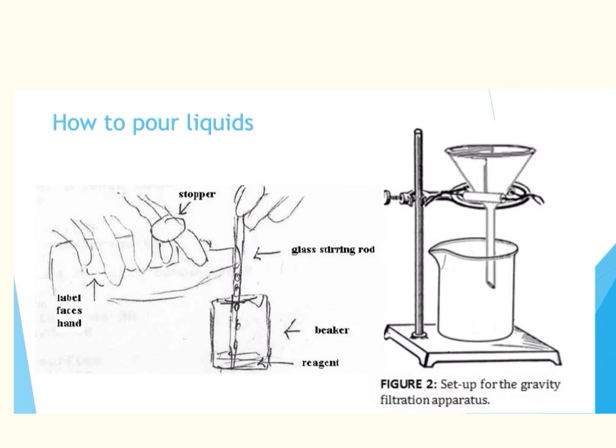Let's look at a few procedures. We're going to start with how to pour a liquid. Here we have a reagent bottle, a stirring rod, and a beaker. You'll notice that we are pouring the liquid down the stirring rod — we pour it slowly down the stirring rod to keep splattering from occurring. This is one procedure for taking a chemical from a reagent bottle and moving it to a beaker. Another procedure is to use designated pipettes to pipette out the exact amount from our reagent bottle and move it slowly and directly into our beaker. Both procedures are allowed.